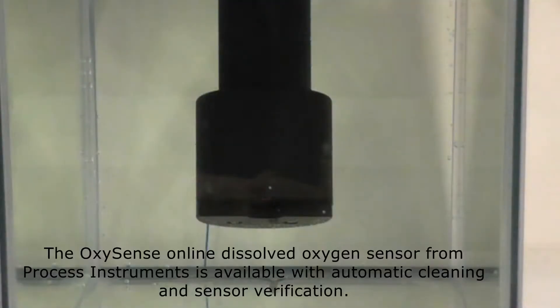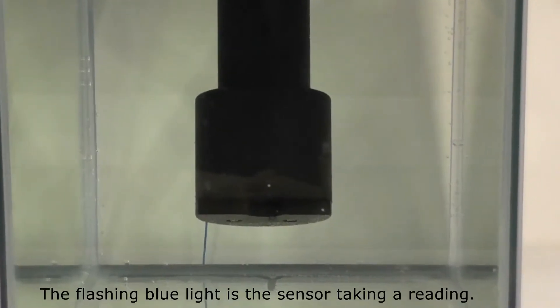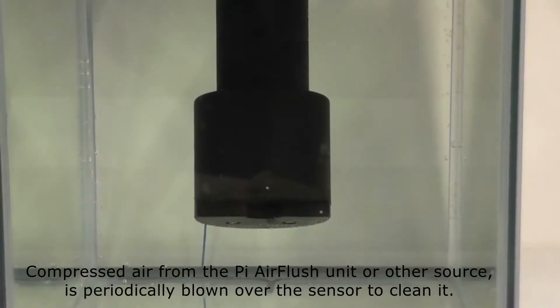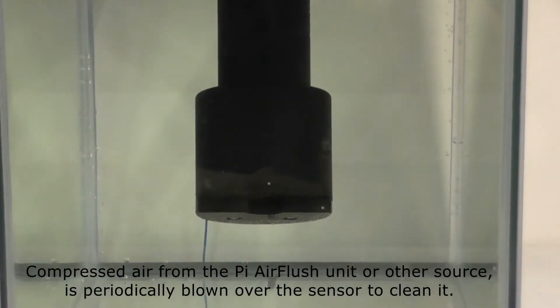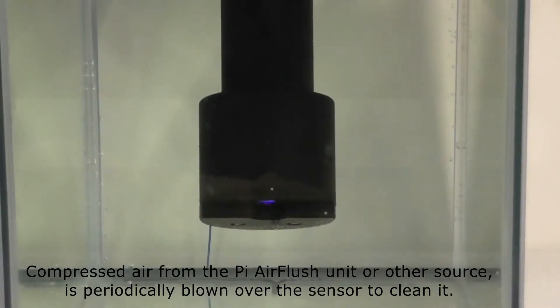The OxySense Online Dissolved Oxygen sensor from Process Instruments is available with automatic cleaning and sensor verification. The flashing blue light indicates the sensor is taking a reading. Compressed air from the Pi air flush unit or other source is periodically blown over the sensor to clean it.